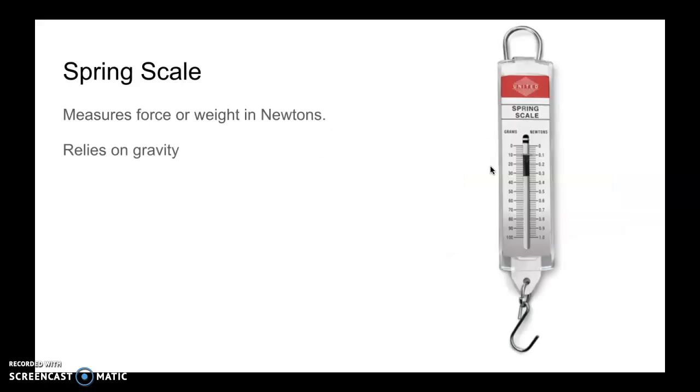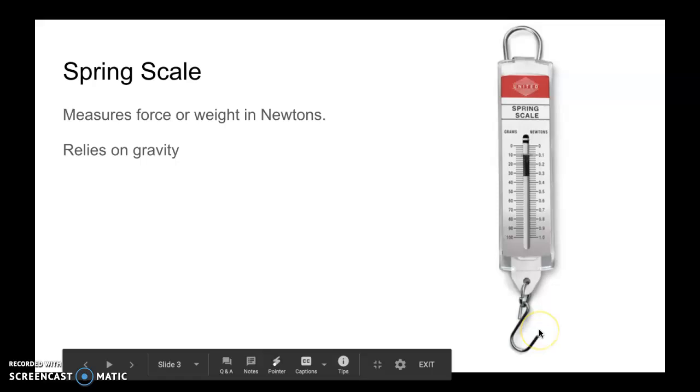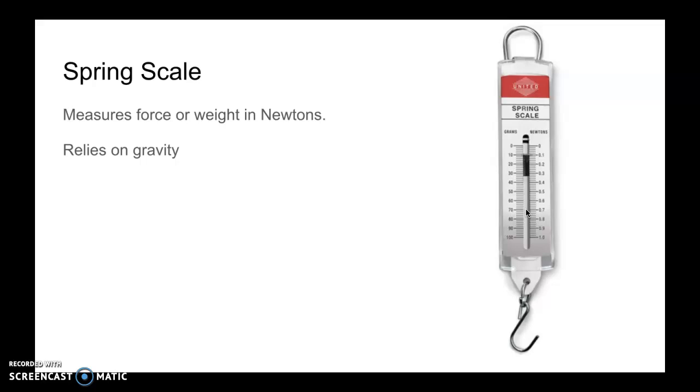This tool is called a spring scale. This is what scientists use to measure weight. The unit of measure is newtons. The way this tool works is the object you are trying to weigh is attached to this hook. The spring scale is held in your hand. The object that is hanging will respond to gravity and gravity will pull down. There's a lever up here that slides down depending upon the weight of your object.